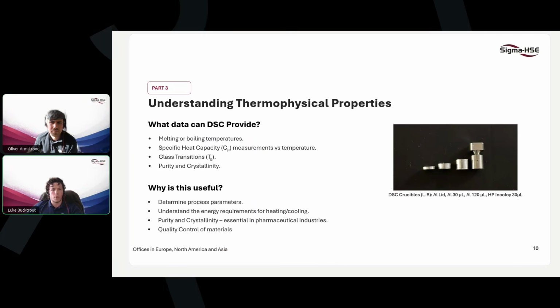Yes, it's a good point and well worth the consideration. It also touches on the point you made earlier about how different solvents can stabilize the intermediates for different decomposition pathways. Even from a basic chemistry standpoint, we know that salt solutions in water can adjust boiling points and specific heat capacity.